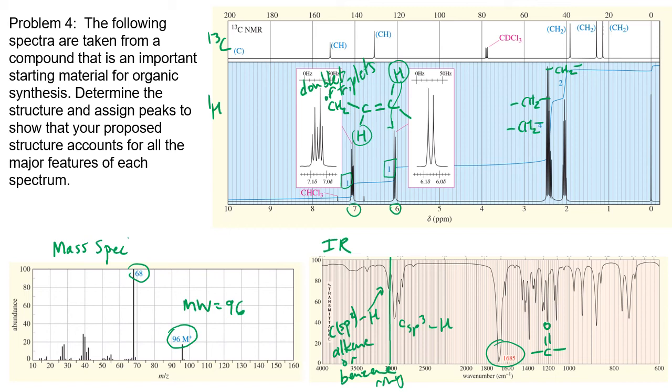And if we look at the carbon-13 NMR, what do we see? Well, it appears we have a CH. Those are our two alkene carbons, because if we look at the chemical shift, that's where we typically see alkenes showing up. And then we see 3 CH2s, which we've accounted for on the proton NMR. So we look at these 3 peaks there. And then it says we have a signal here, which is a carbon, and apparently we just can't see that peak.